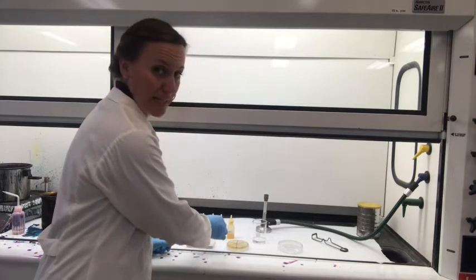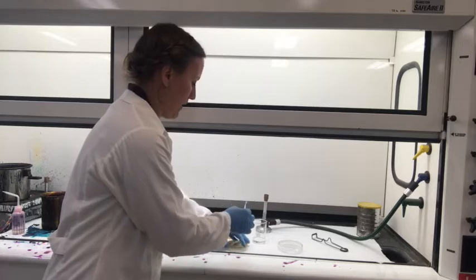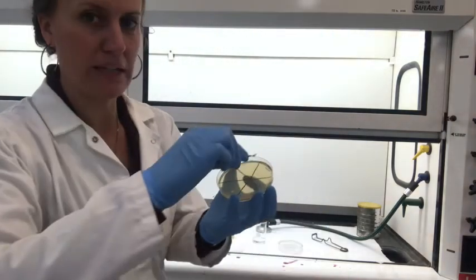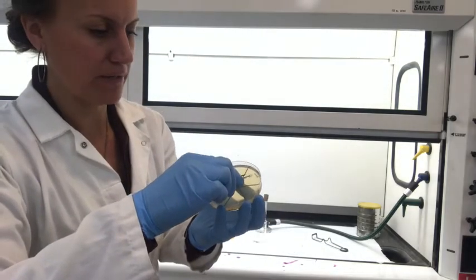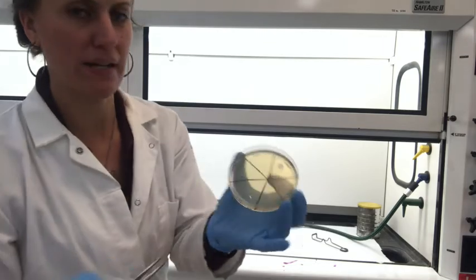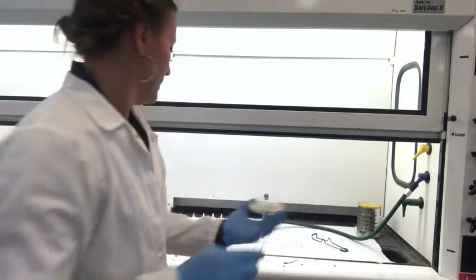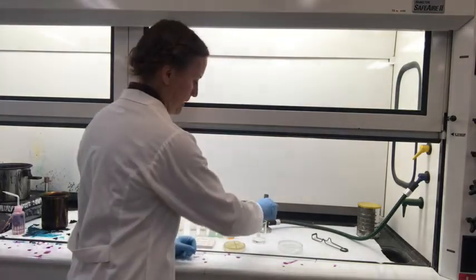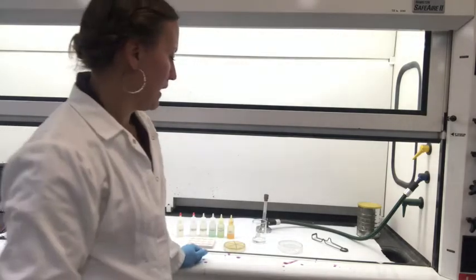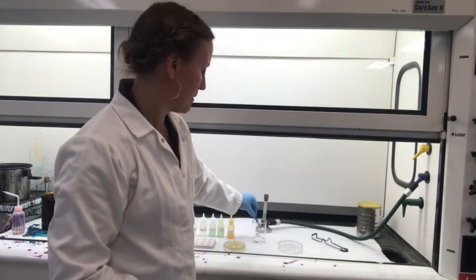With the saturated disc, and to make sure that there is no dripping from this disc, I'll find the same section on my TSA plate, and I'll simply add the disc to the TSA plate right in the center of that pie-shaped wedge. With this, I'll just press it down, and the disc is now on my TSA plate. From here, I'll put my forceps back in the ethanol to sterilize them, and I'm ready to move on to my next one. I'll give you just one more demo of the same practice.